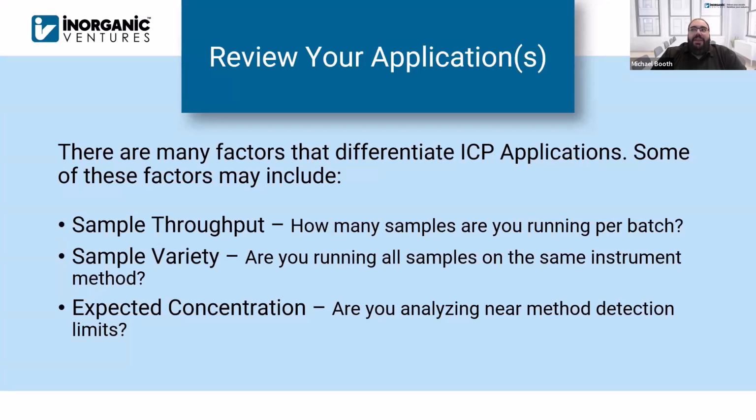And when you think about these factors you have to review for your application, there are also factors that you should review in terms of just your laboratory as well, that go beyond the individual method, and that could be the overall cleanliness of the lab. Sometimes if you're doing large dilution factors, there are contamination risks, and we'll talk again about that more in a second.